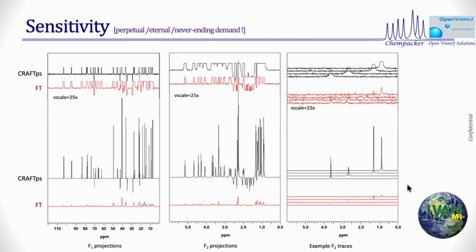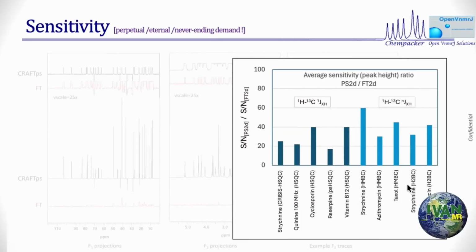Here is the reason. We did this. This is the final paper, and in the paper we actually put this in. Again, I ask you to go back to the YouTube channel to look at that. This is a signal to noise improvement you get, not detectability. These have nothing to do with detectability. This is just signal to noise. 60 times. That's the signal to noise in pure shift over the signal to noise in FT. Over, not percent. To emphasize that point, we made that statement in the paper. It is not a percentage, because we all tend to talk about, I got 20% more, or I got square root of 2 more. We are not talking about percent. We are talking about factors. And it's nothing new. I did not get anything. It's the same 2D data input. That means detectability in the time domain is exactly the same because it is the same input. I just processed it differently.